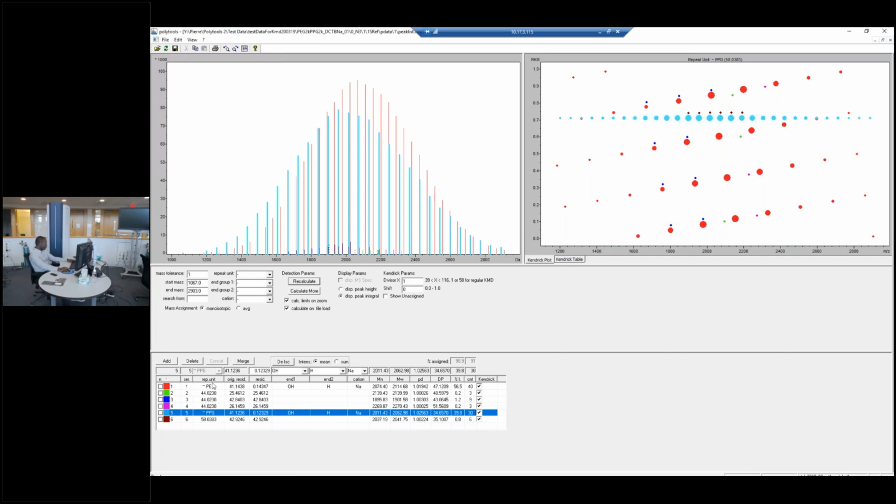And we have quite a few other series present that MALDI can see. And this is one of the advantages of MALDI compared to other techniques such as NMR, for example, or GPC, which are bulk analytical techniques, which means basically they look at your sample as a bulk and tell you what they see.